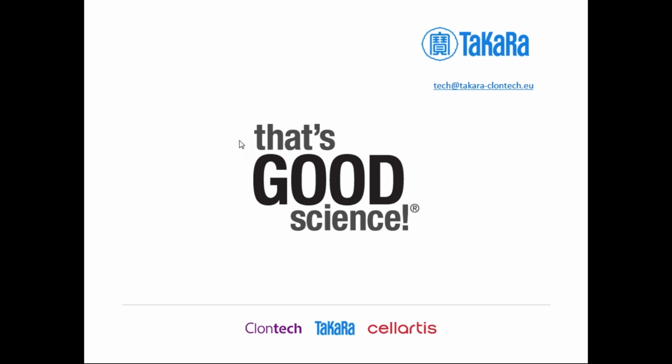Then we have another question, whether it's possible to deliver a repair template for homologous recombination at the same time with the Gesicles to do the knock-in. So yeah, this is a very interesting question. And for the moment, unfortunately, we don't have a method to pack a repair template into the Gesicles.